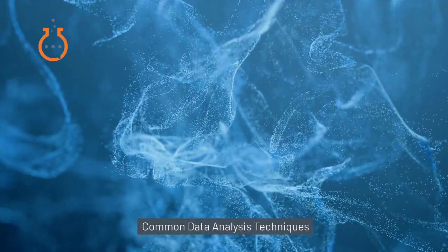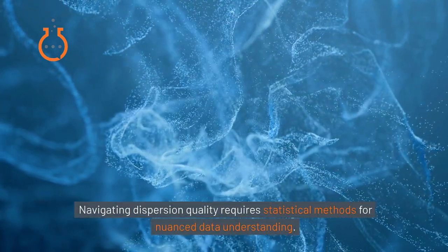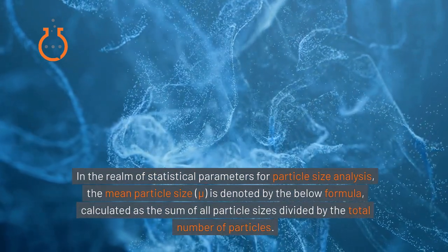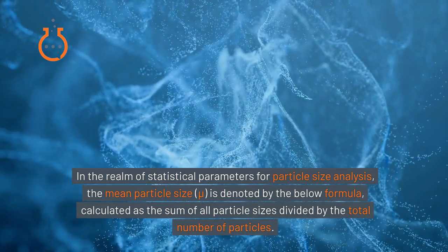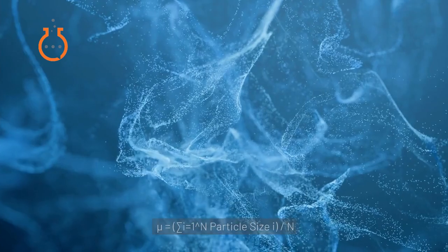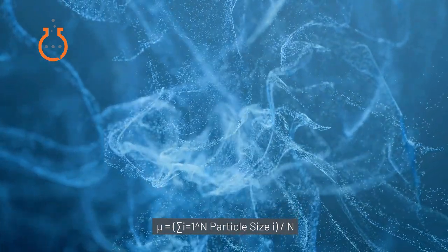Common data analysis techniques. Navigating dispersion quality requires statistical methods for nuanced data understanding. In the realm of statistical parameters for particle size analysis, the mean particle size, mu, is denoted by the below formula, calculated as the sum of all particle sizes divided by the total number of particles. Mu equals 1/n times the summation from i equals 1 to n of particle size_i.